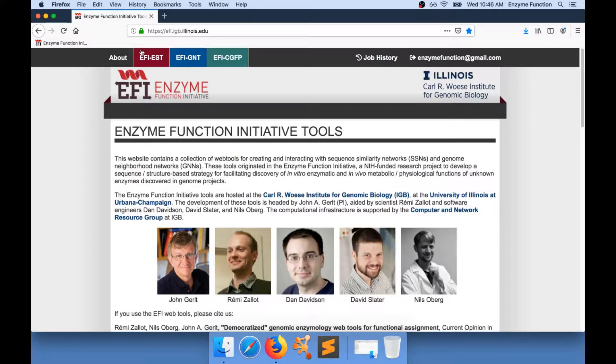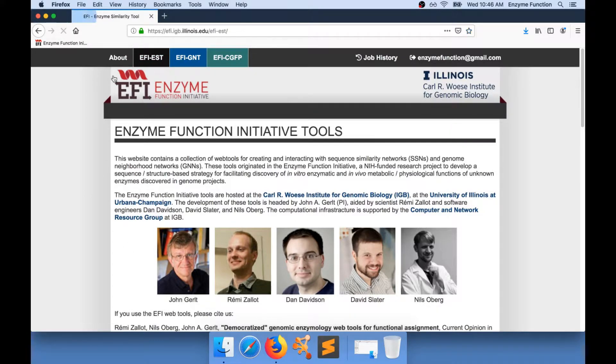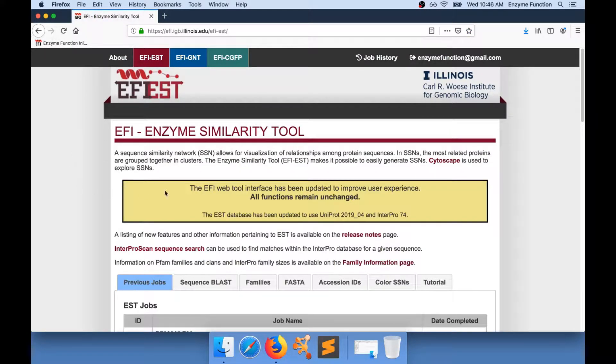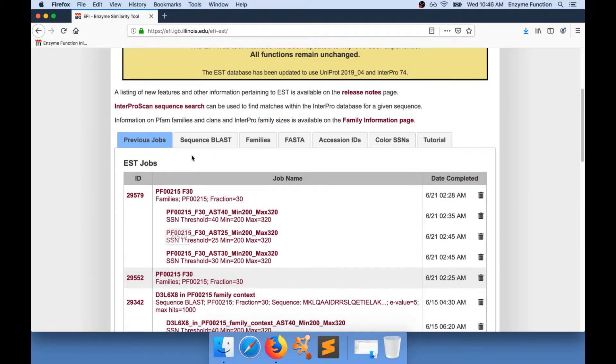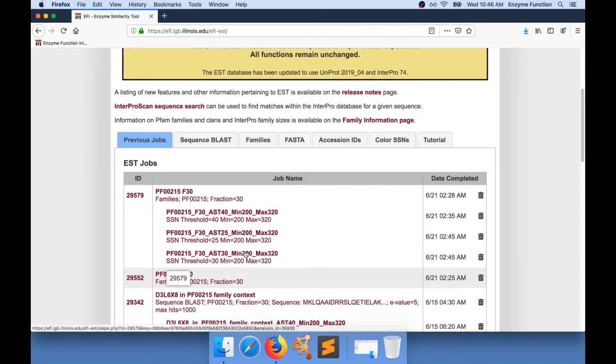On the EFI EST website, you can create sequence similarity networks. I have generated some sequence similarity networks and I'm going to download one of them.